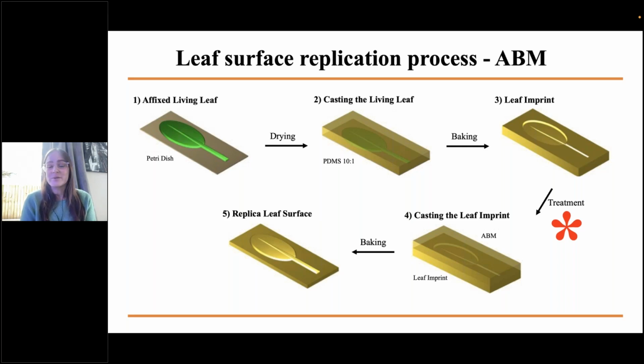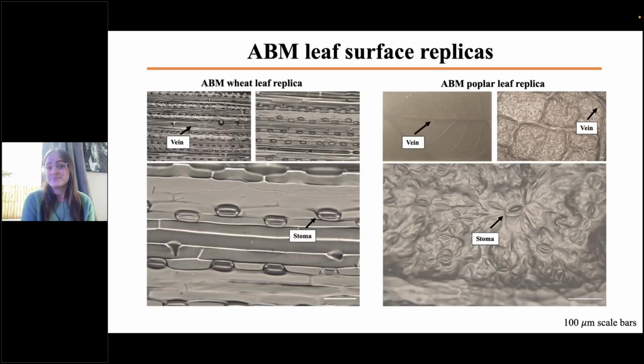Tried no treatment, but unfortunately PDMS is very hydrophobic, and agar-based media is hydrophilic, so they weren't compatible. You get lots of bubbles. If we tried no treatment but degassing, same thing. But actually, if I treated it with oxygen plasma to make it temporarily hydrophilic, we were able to get results like these ones here.